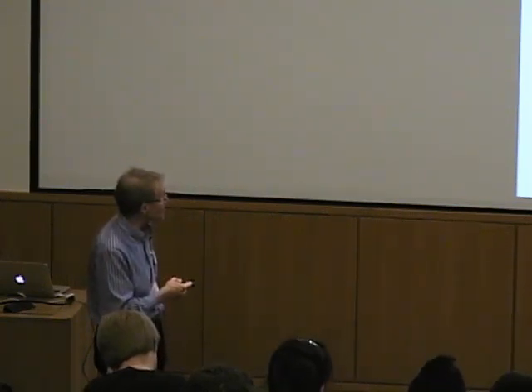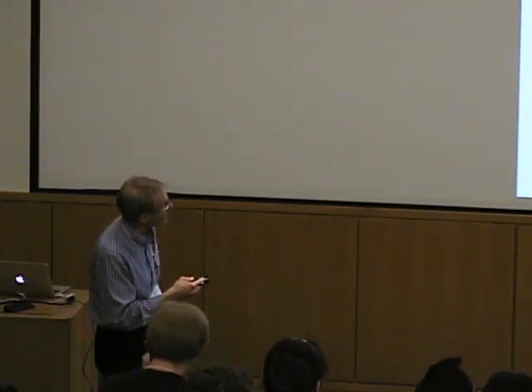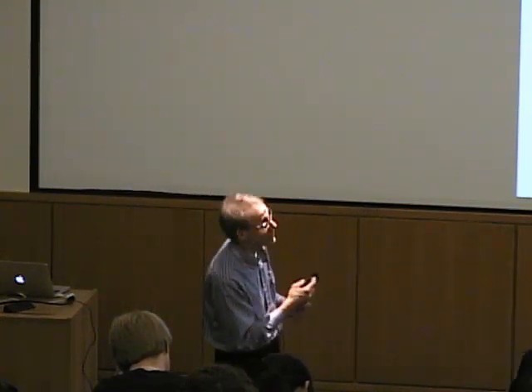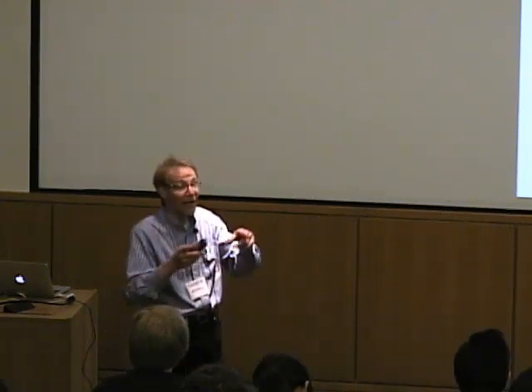First of all, we did a 1 set of sites binding to this first inflection. Then we did a 2 set of sites binding to the second and third. Now these two, in fact, allowed us to get good numbers for the enthalpies. Okay? Turns out for the binding constant, it's more tricky because now we got a competition between EDTA and the metallothionein. So we have to use the competition binding model, and that only is a 1-site model. So we had to use that for this last inflection here.